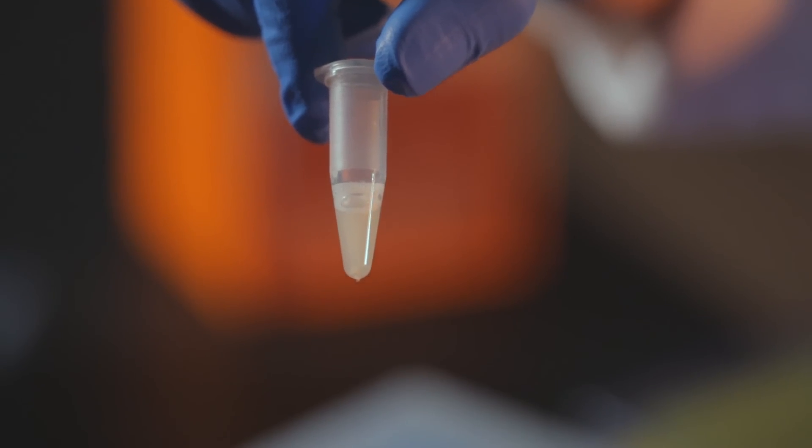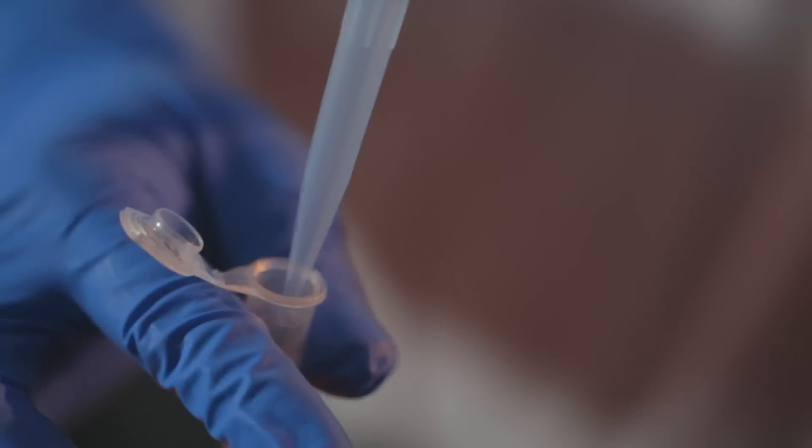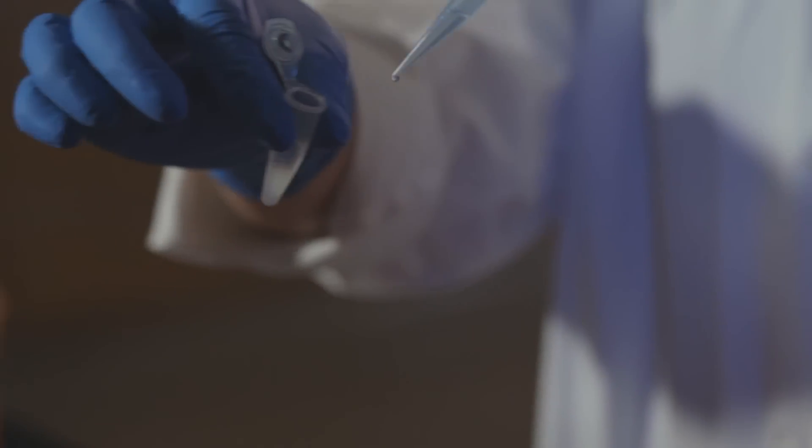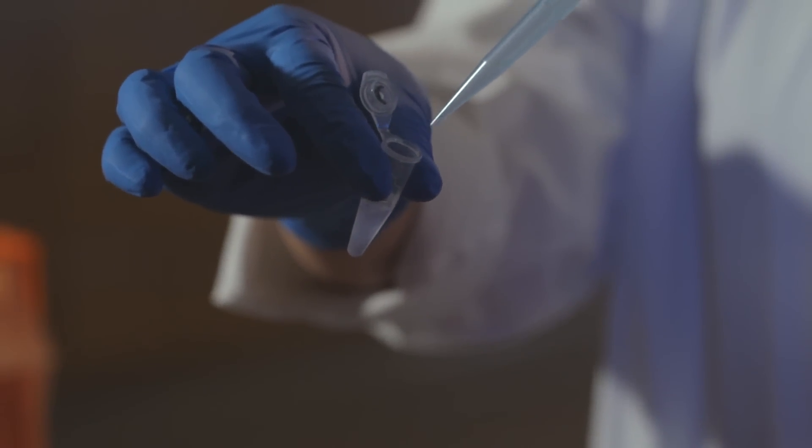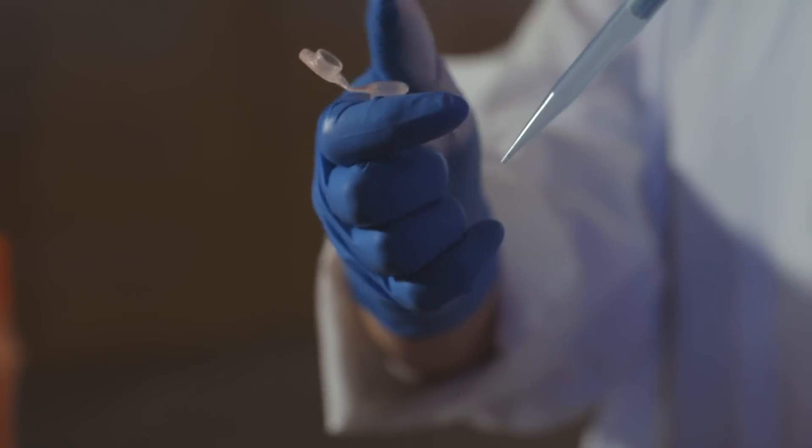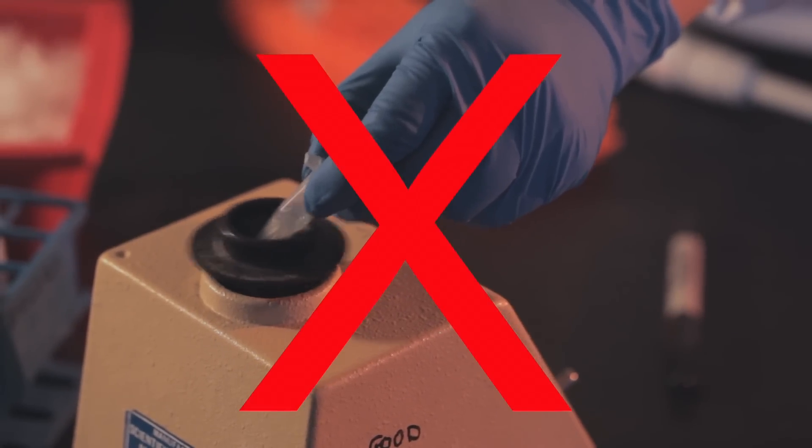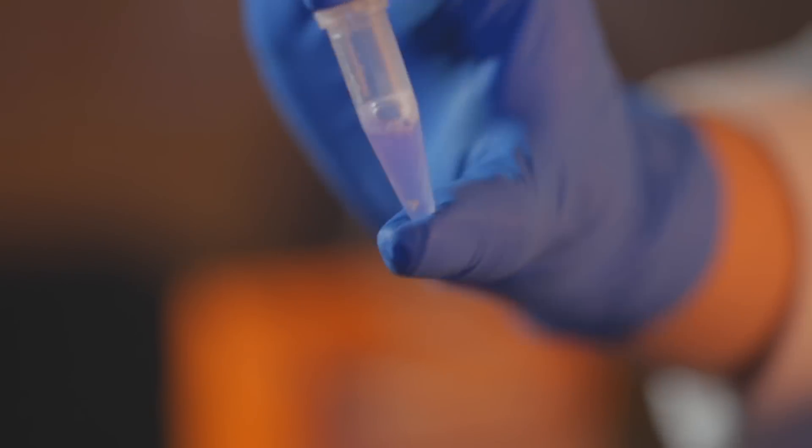Once all of the pellet in your tube has been resuspended, carefully add 250 microliters of the lysis buffer. Mix thoroughly by inverting the tube 4 to 6 times. The solution should become viscous and slightly clear. Do not allow the lysis to continue for more than 5 minutes. Do not vortex at this point, or else the genomic DNA will be sheared into small fragments and will contaminate the plasmid DNA.